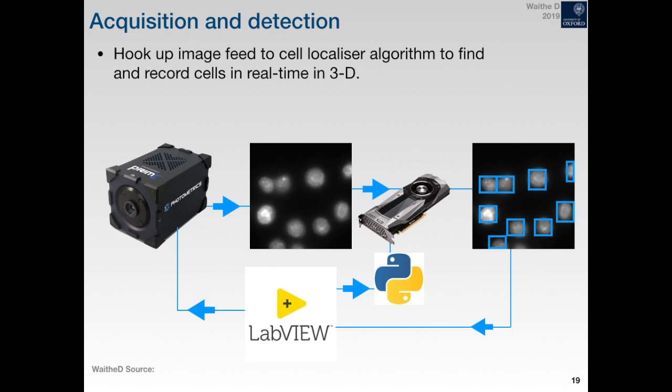LabVIEW is software which can interface with hardware, and it can also keep a Python kernel alive. So the Python's always running and it calls functions from it: evaluate this image. If you had to load Python afresh every time you wanted to evaluate an image, it'd be very slow. So it's very important that you have a control mechanism which can keep the Python kernel alive and feed it the data dynamically. That's kind of why I was using LabVIEW. The reality is the latest version now works completely in Python. So you don't need LabVIEW anymore because people have managed to write the drivers completely in Python. So it makes life a lot easier.